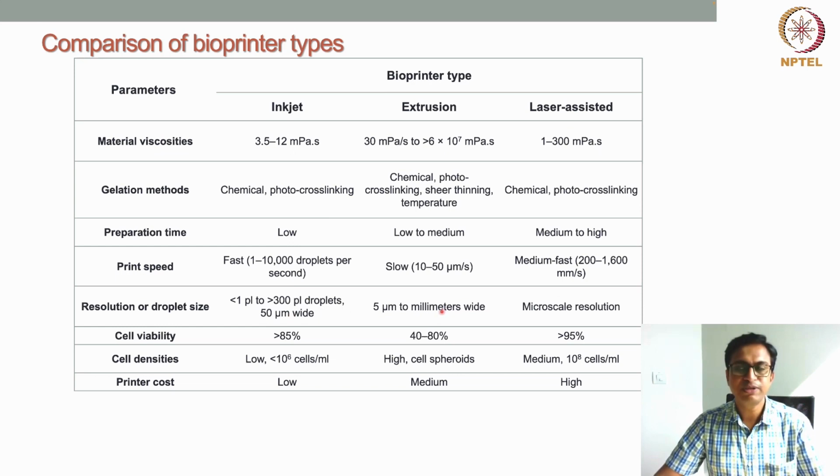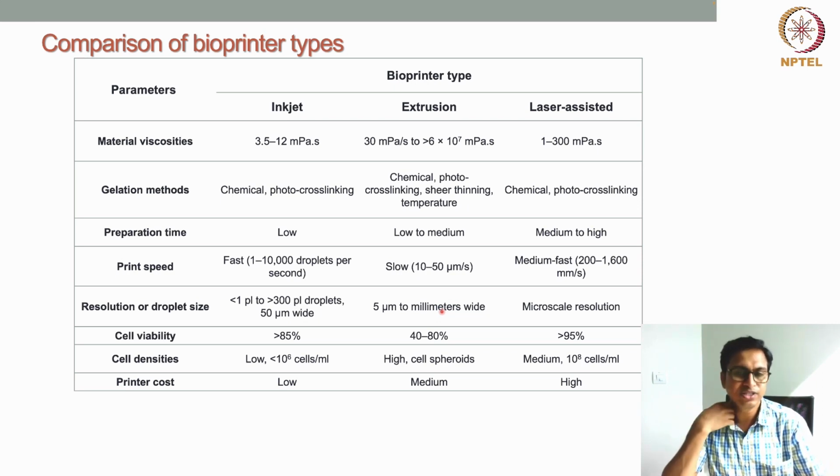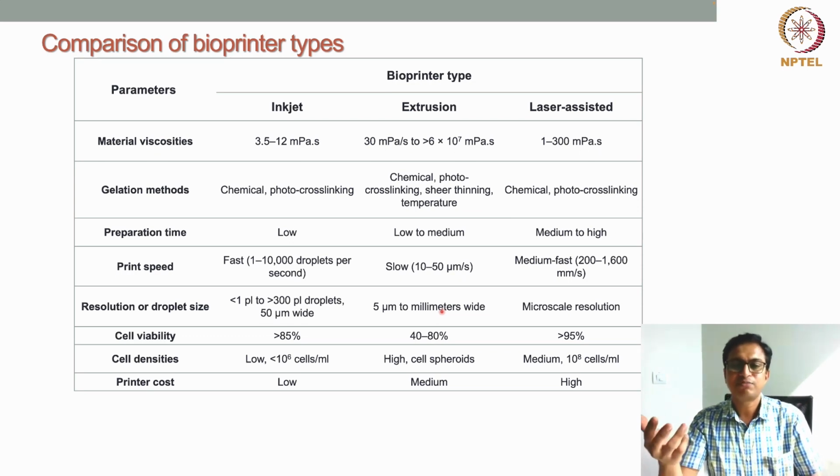In case of extrusion based bioprinting, the resolution is directly dependent on the nozzle diameter, right? So if we can have fine nozzles, then the resolution can be high. But if the nozzle size is more, then again the resolution will be compromised.